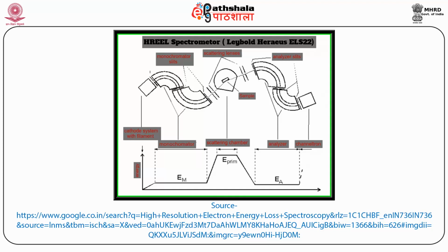An Omicron FM3 evaporator allows one to evaporate metal films of a thickness as low as 0.1 monolayer to several hundred nanometers. A really thin layer can be analyzed with this.